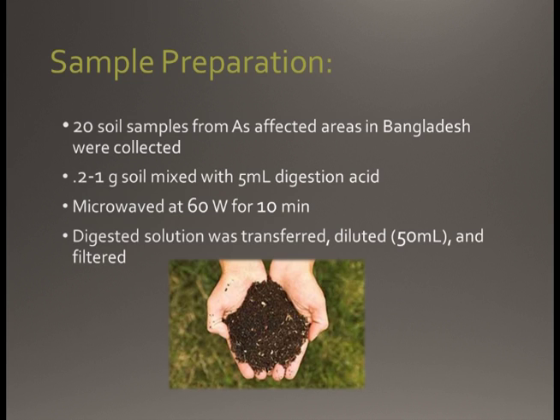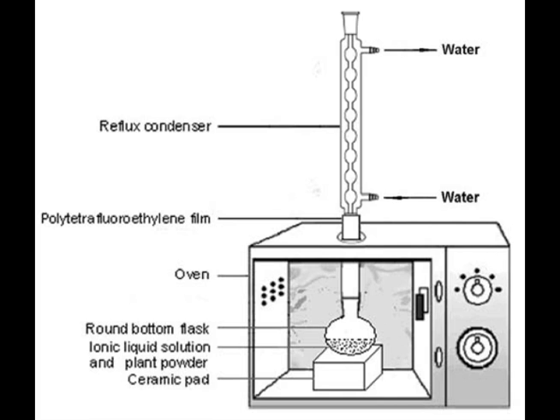And efficiency of extracting arsenic species from soil depends on 2 things. First, the extraction system, and second, the extraction solvent that they needed to use. So first, I'll start with the extraction system. So they used microwave-assisted extraction, or MAE, and this is an automated approach that applies pressure and temperature during extraction, and this makes it faster and less labor-intensive than alternative methods.